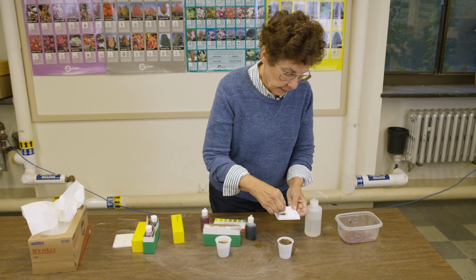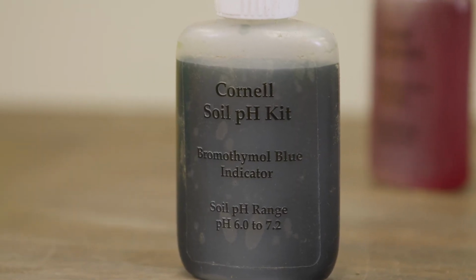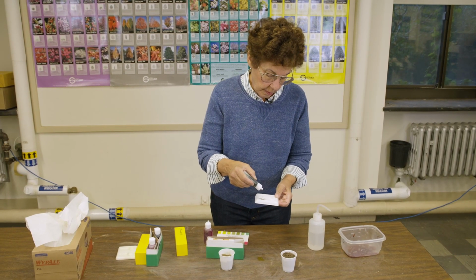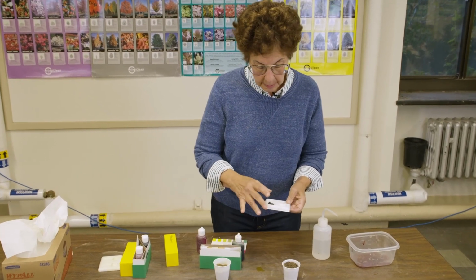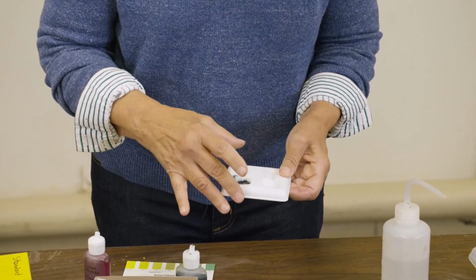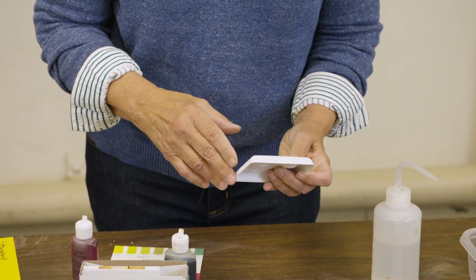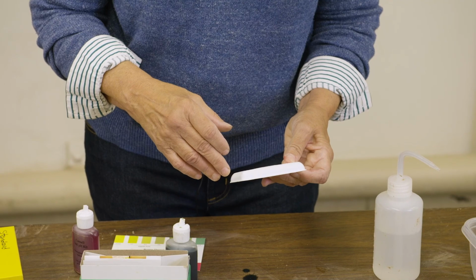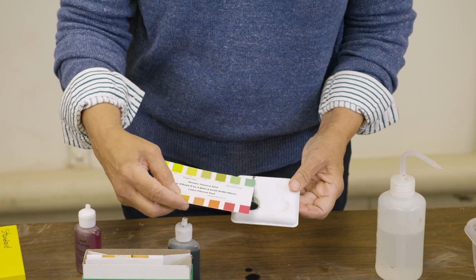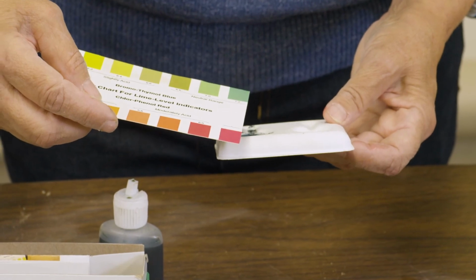So we're going to put a little bit of soil in the bowl. Start again with bromthymol blue, which is the neutral range. Drop, drop, drop. We have a little bit of free solution. Mixing it with the soil, and then getting a bead down the channel. And here, instead of that kind of yellowish green, we have almost a blue-green color, which would be at the end of the bromthymol blue chart, sort of 7.2.